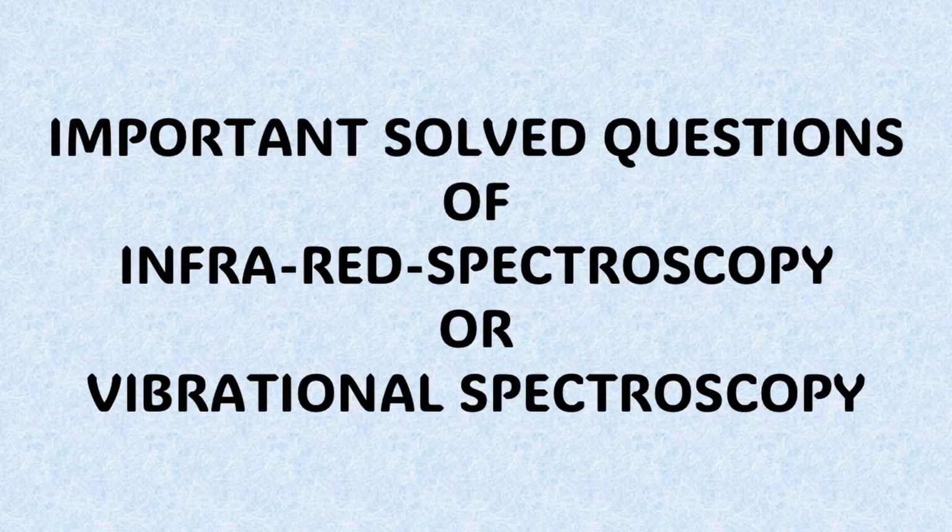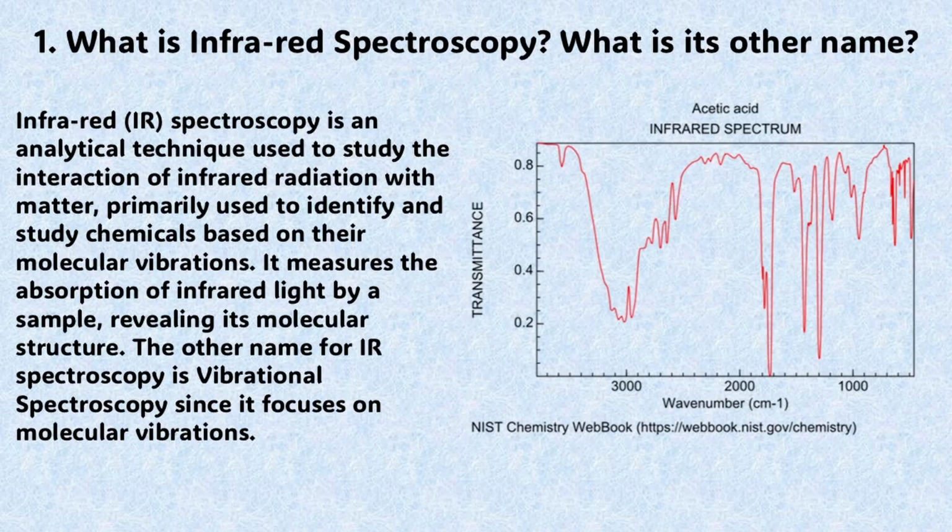As promised, we are back with the second video of the series titled Learning Spectroscopy with the help of question-answer method. In this video, we will study the second type of spectroscopy, the infrared spectroscopy, following the same method of learning. I mean, interaction method or question-answer method. Let's start. The first question is, what is infrared spectroscopy?